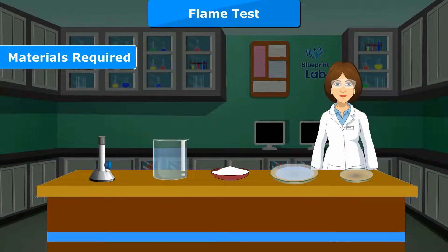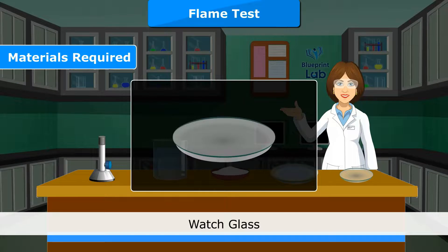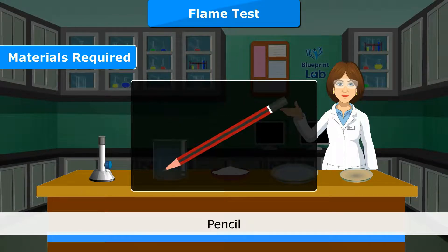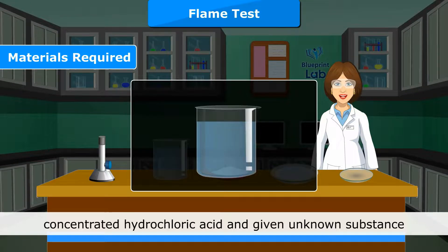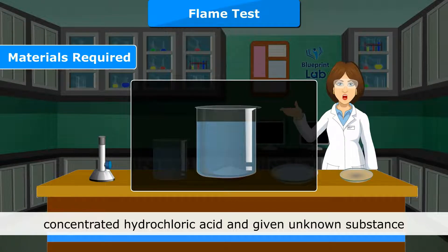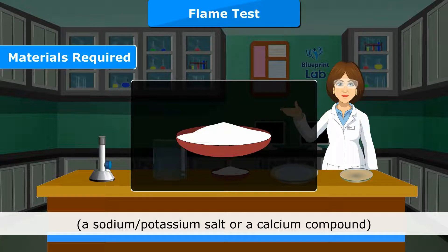Materials required: a platinum wire with one end fused in a glass rod, watch glass, pencil, Bunsen burner, blue glass, concentrated hydrochloric acid, and the given unknown substance — a sodium or potassium salt or a calcium compound.